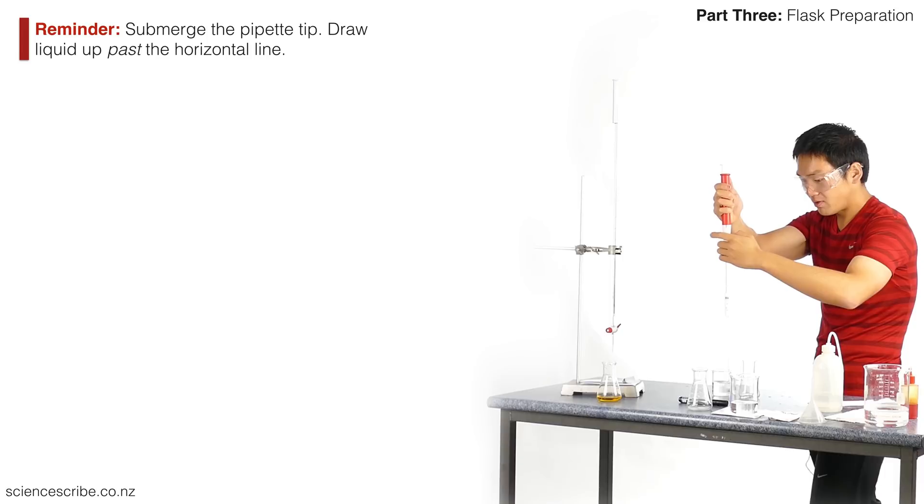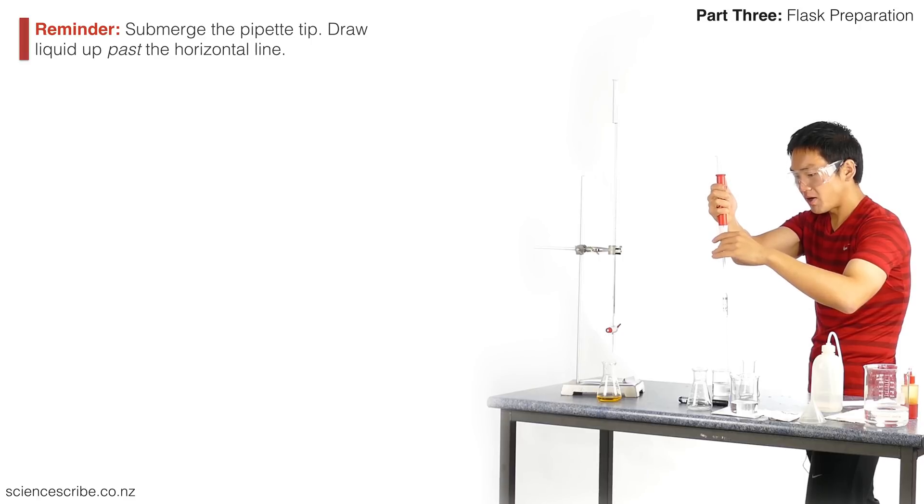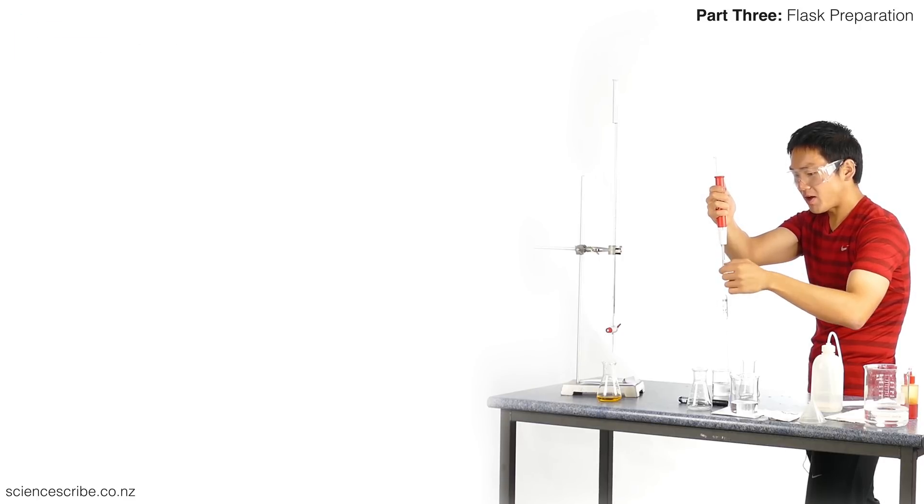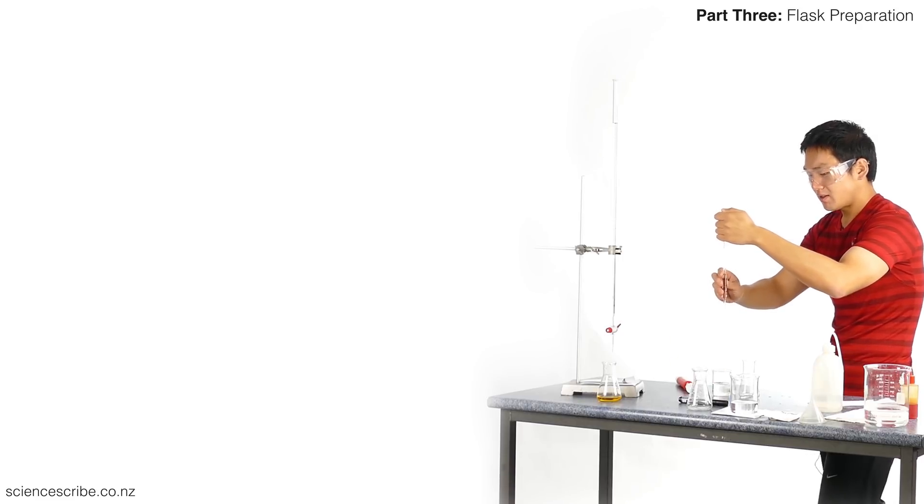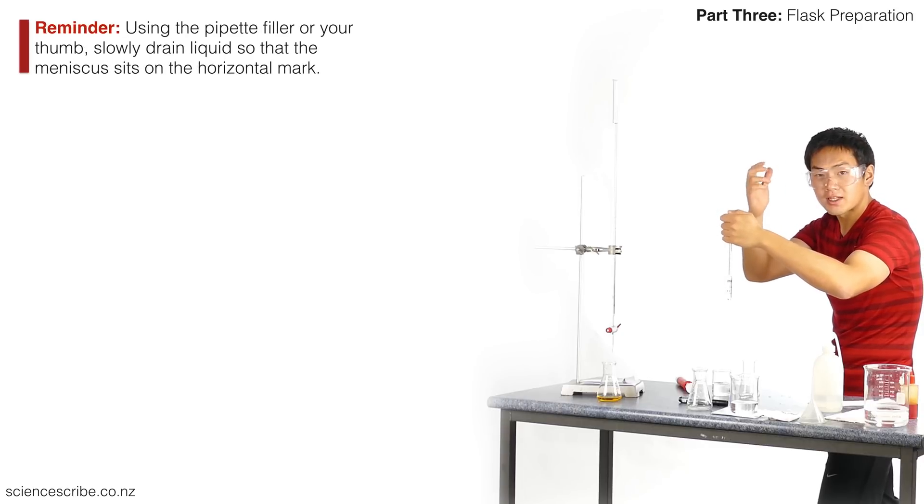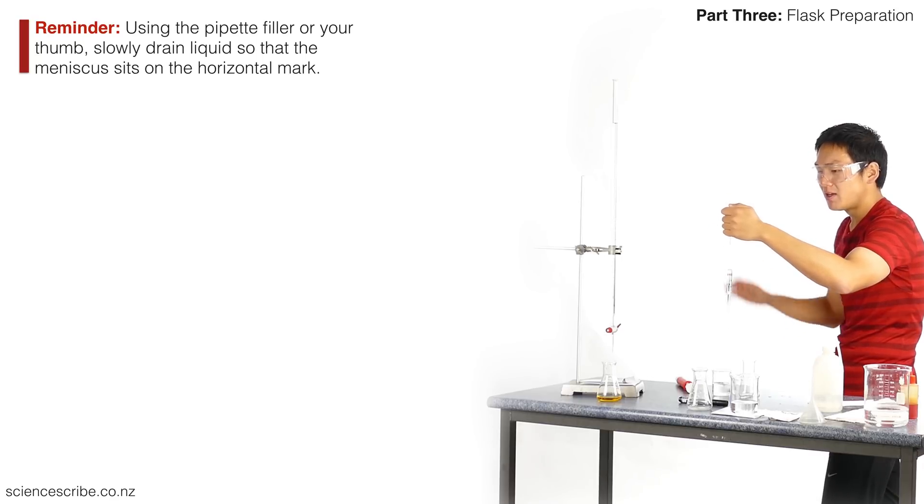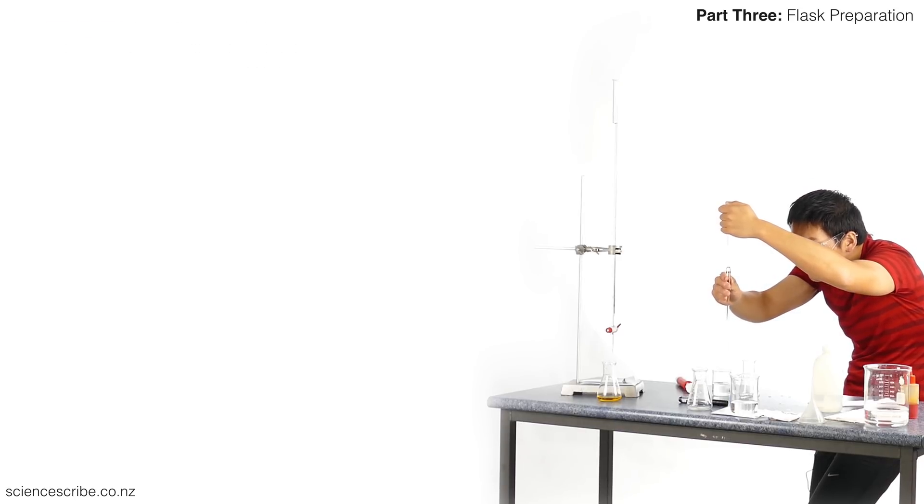I bring that up past that horizontal mark in my pipette. Remember, no air bubbles—if there's air bubbles we start again. Bring it up high but not too high because we don't know who else was using this pipette filler. Take off the tip, put your thumb over the top, and slowly twist with your other hand. This one's clamped down but I'm not forcing it down too much. There's just enough to stop the liquid from falling by itself. You want that meniscus to sit just on top of that horizontal line.